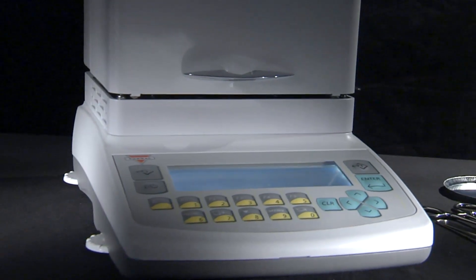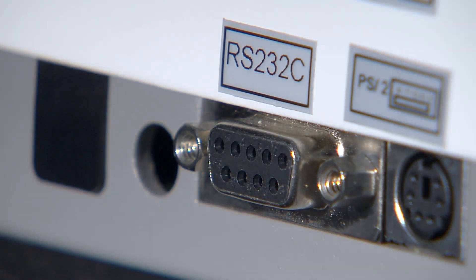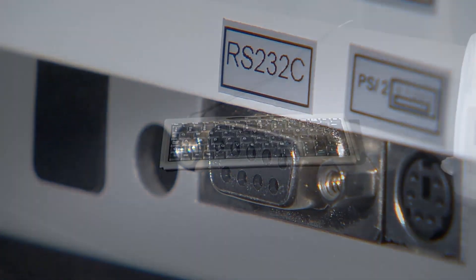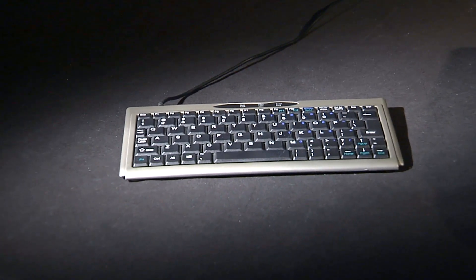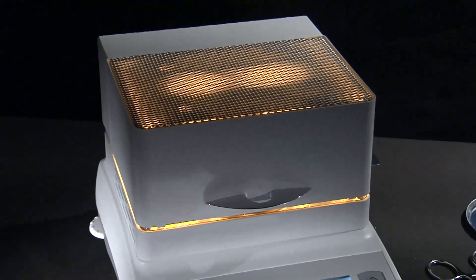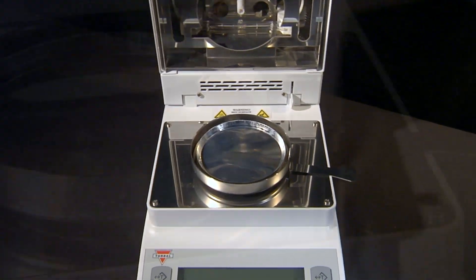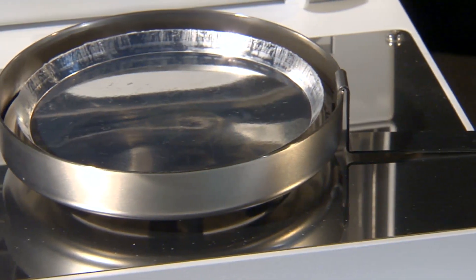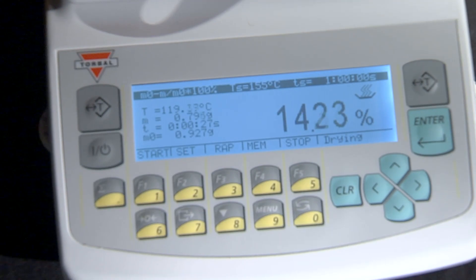Each unit is equipped with an RS-232 interface port, as well as a PS2 external keyboard port, which allows for an external keyboard connection that becomes particularly useful when entering analysis notes and remarks. The AGS is equipped with stainless steel pan supports that are resistant to chemicals and possible staining, a 20-key sealed front panel, and dual tear keys.